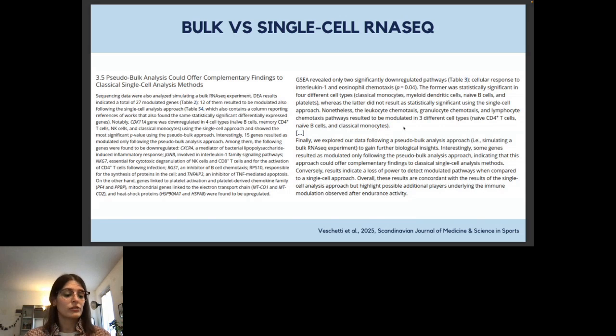Or maybe the cell type is very rare, so we have very few cells belonging to this cluster. Somehow, when analyzing all of them together, we can boost the signal of these genes, and maybe some of them become significant. So it is an exploratory way to find some markers, for example, and then you, of course, go on and validate it.